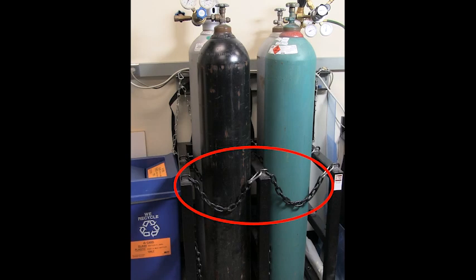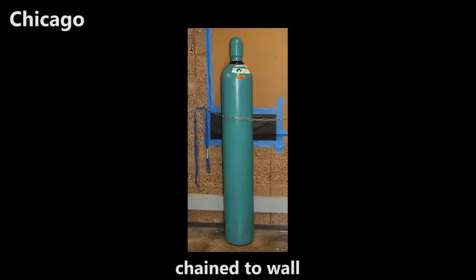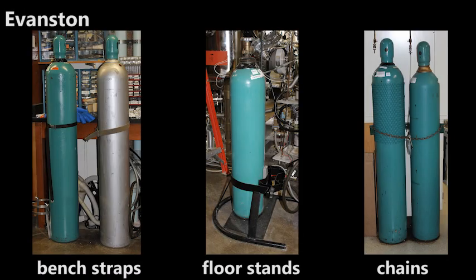Ensure that the cylinder is properly secured. In Chicago, cylinders must be chained to the wall. In Evanston, cylinders may be secured by bench straps, floor stands, or chains.